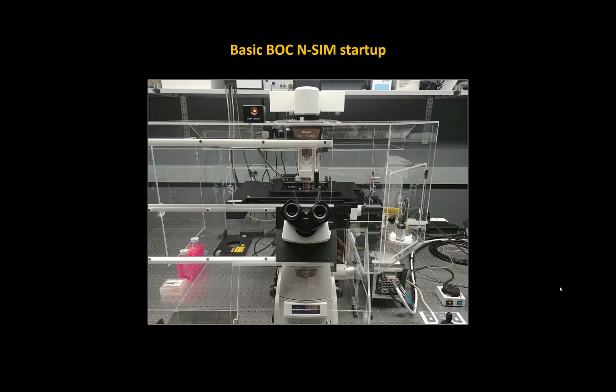It is going to offer roughly about 2 times the resolution improvement over our standard confocal, but it's not going to be quite as high resolution as images you would acquire with something like Storm. So it sits kind of nicely in the middle between those two instruments. And luckily, it's also very simple to use and relatively easy to get going as well. So let's go ahead and dive right in.